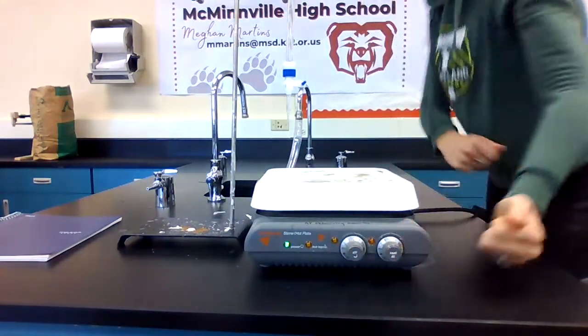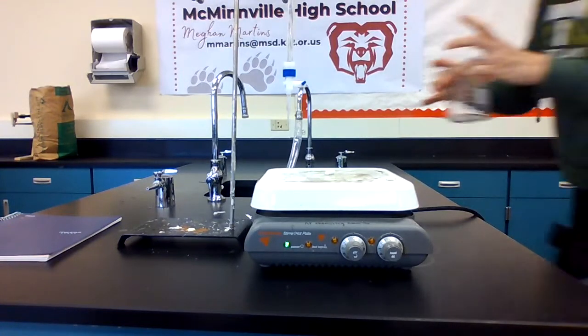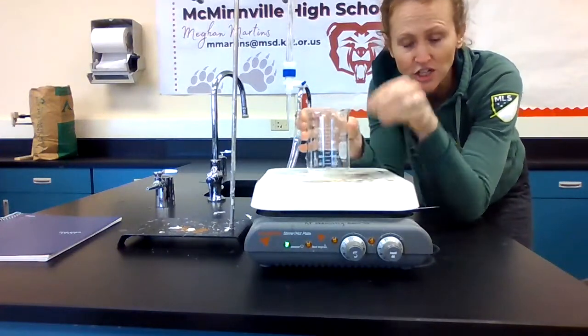What we're going to do today is use it to help us in our titration.